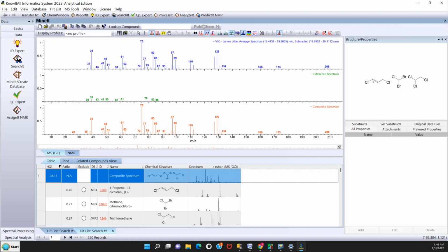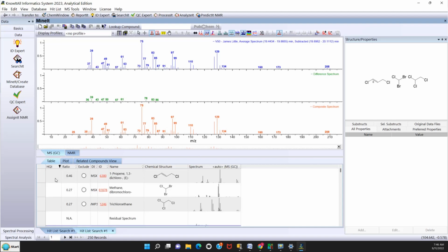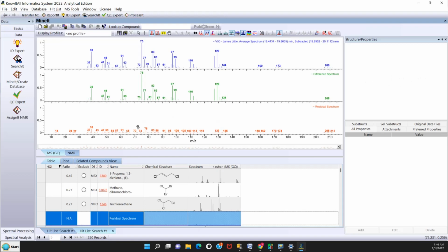Here we have the results of the mixture of 3 analyses. If you look up in the right corner, you'll see it proposes to be a mixture of 3 components now. Let's go look at the numerical results and the residual. We go to the bottom, click the left mouse button, and you can see now instead of around 85% of the accountability, we have closer to 98%. Also, we'll go down and look at the residual spectrum and see that there is very little left here. So things are looking more encouraging here. Let's go down a little further.